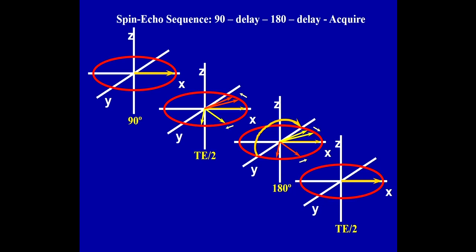If we match the length of time, the echo time, for here versus here, and then we open the receiver, we will pick this up right at where these refocus. Whatever phase coherence is lost due to the inhomogeneities will refocus for us with this scheme. And we start out with the full intensity as if we had only T2 decay.